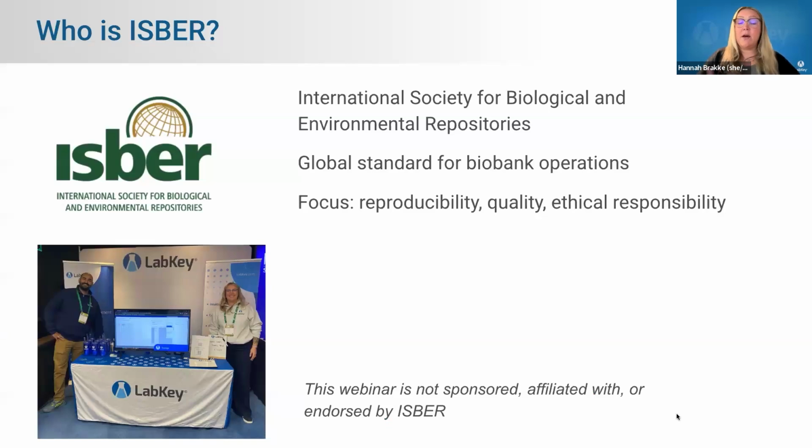Before we dive in on how our software helps support these best practices, let's acknowledge the foundational role that ISBER has in the biobanking industry. ISBER stands for International Society for Biological and Environmental Repositories, and is widely recognized as the global authority on biobanking operations. Their best practices serve as a critical reference for biobankers to ensure reproducibility, uphold quality standards, and maintain ethical responsibility in the collection, storage, and use of the biospecimens.